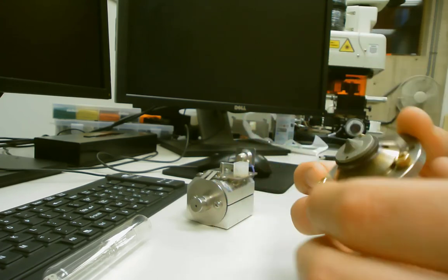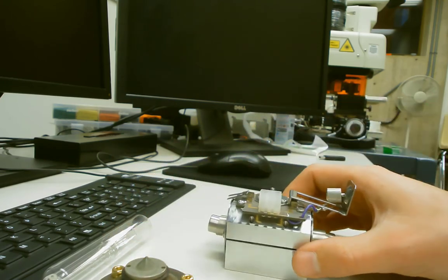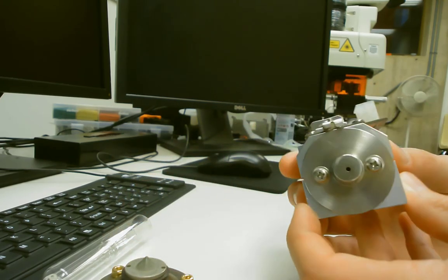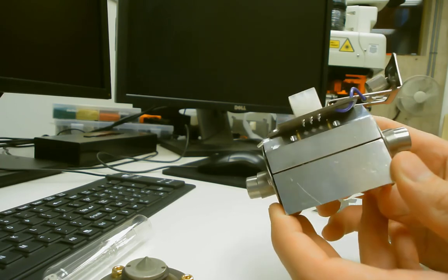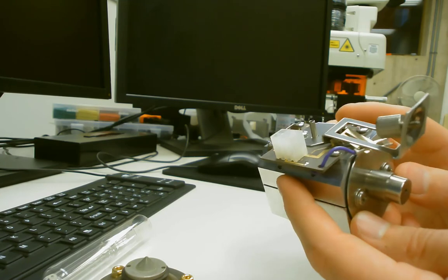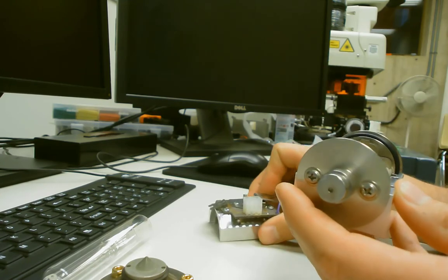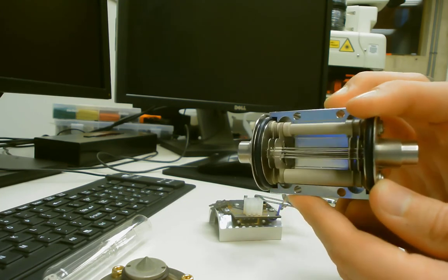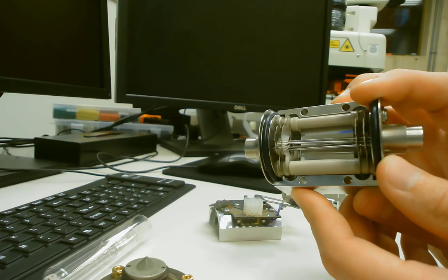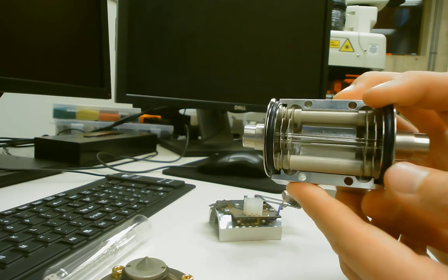And then immediately after the lenses is the octopole. Somehow we have a broken octopole. I have no idea how you break one, but they are not something you want to be handling very often. But the octopole is just what it sounds like. It's got 8 poles, and they are nominally all parallel to each other and equally spaced around a central axis, but these are off kilter quite a bit.